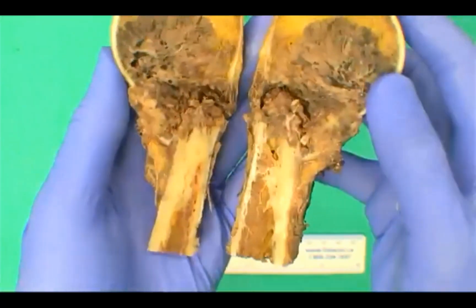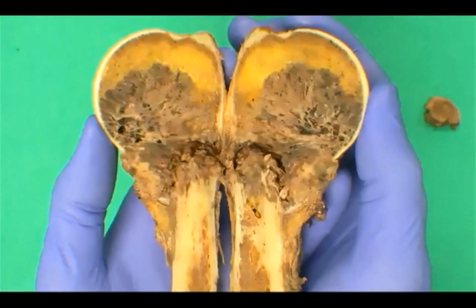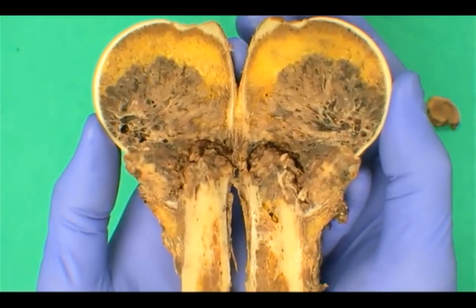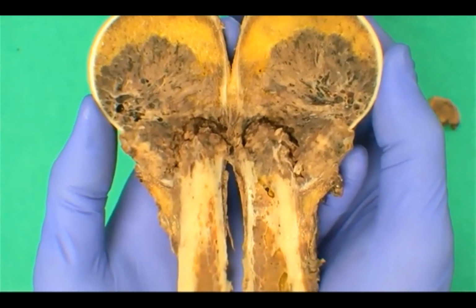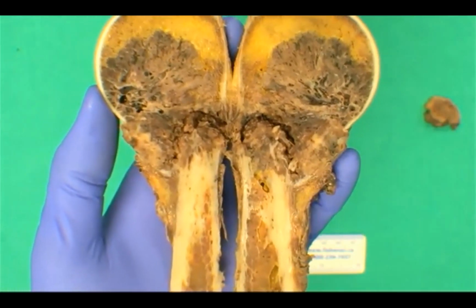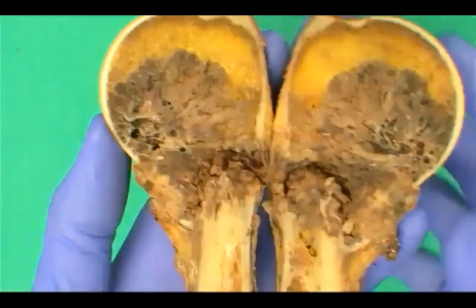If we open this up, let's take a look at that, and let's get some descriptors or some gross words into the chat about what we're seeing here. Camera's struggling with us a little bit today, so forgive the focus here. Go ahead in the chat, just put down some descriptors of what you're seeing here, how you might approach the gross in this. Cystic, it's well-defined. Hemorrhagic, yep. Well demarcated, it's brown. Trabeculated, spongy, great.